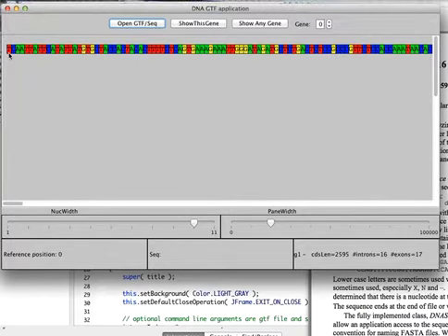But I've cut them down. The initial one only has two sequences in the file. The original organism has several thousand. They are the longest two, so they are the closest things to a chromosome that this organism has, or at least had at the time I got the data.